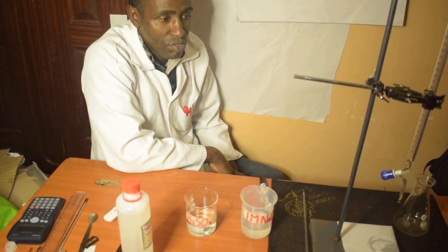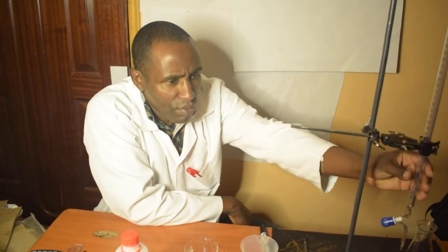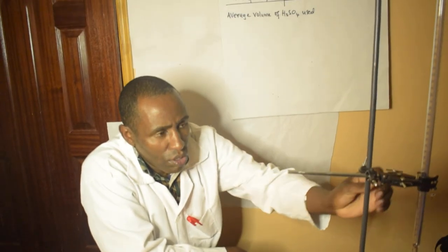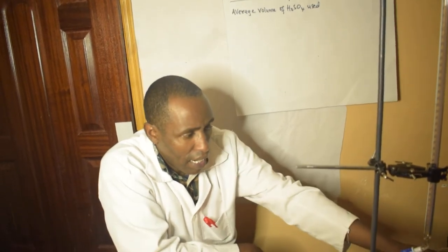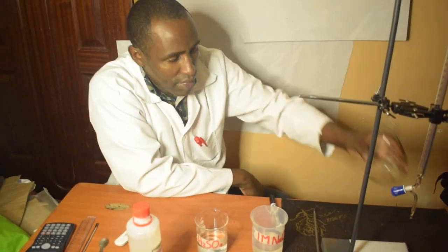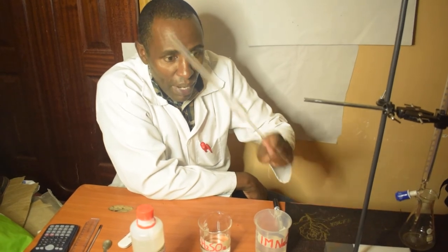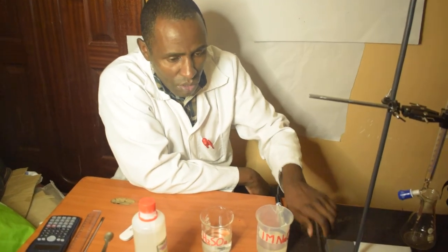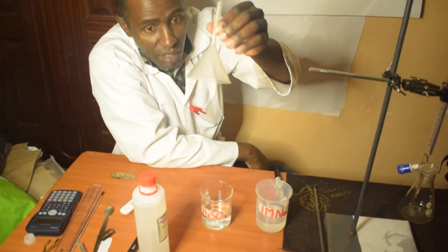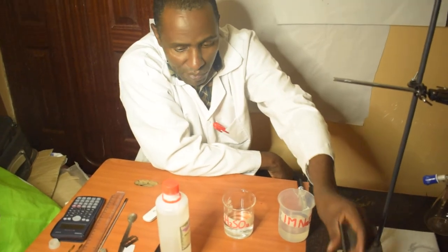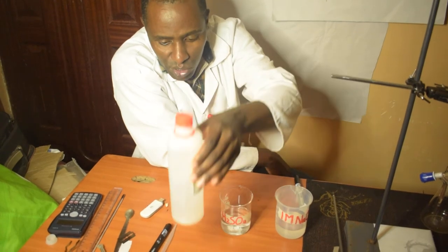With me here I'm going to have a burette, a retort stand, a conical flask, a pipette, and a funnel that I'll use to fill my burette. And of course I'm going to have an indicator which shows the end point of the reaction.